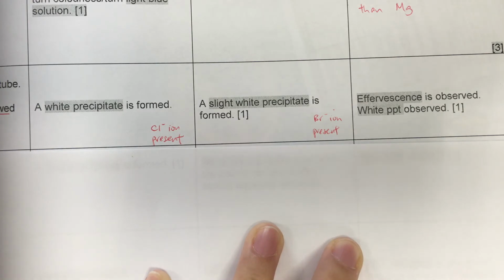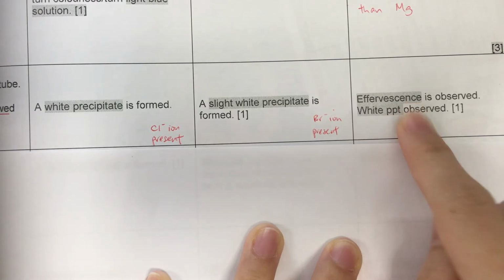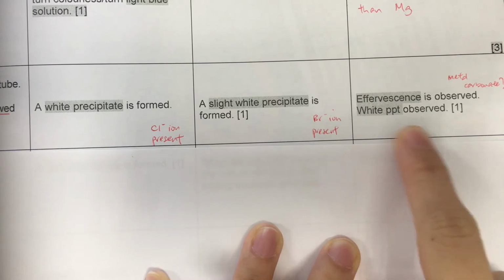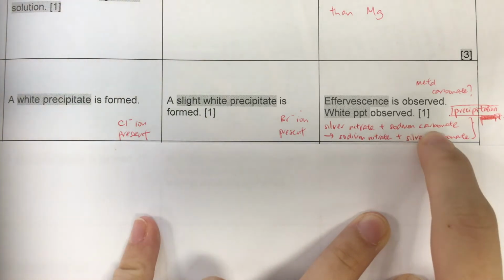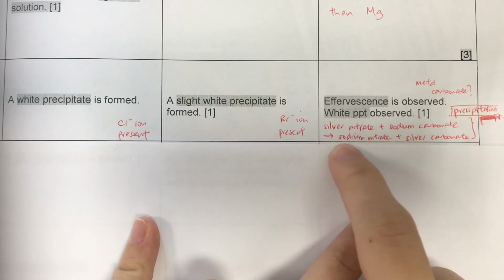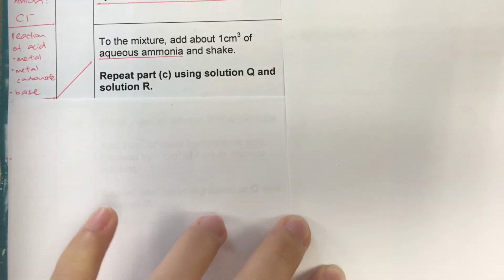Okay, so in this case, these are the observations that we see. So we are not sure if there is chloride ion in this, as we also see effervescence. So we just think that it could be a metal carbonate reacting with an acid to get the effervescence. Okay, so we're not quite sure why there's a white precipitate, whether it's a chloride ion or whether it's a case of soluble salts reacting with soluble salts to get an insoluble salt, which appears as a precipitate. Okay, but this is just a guess. You do not need to know this, but it's just a guess that this may be the one happening.